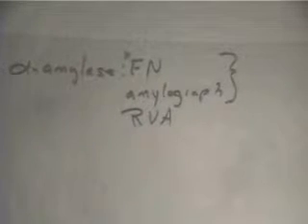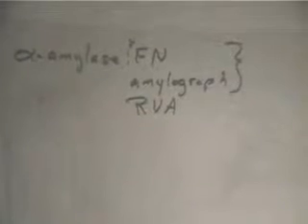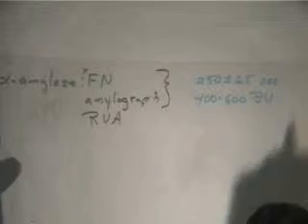So if we're looking at optimum for a yeast-leavened product, what kind of range would I look for on falling number? 200 to 300 seconds. I'll go a little tighter, 250 plus or minus 25 probably, but in that ballpark anyway, of seconds. And amylograph, 500 to 600. I'll go a little wider: 400 to 600 BU, Brabender units.